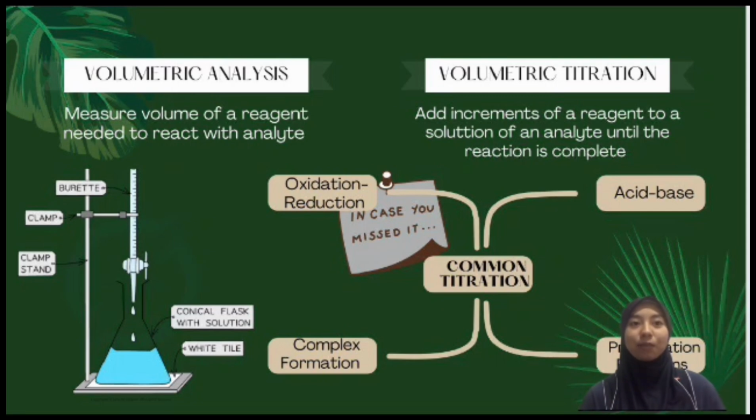Today we're going to talk about volumetric analysis, also known as titration. Volumetric analysis is measuring the volume of reagent needed to react with the analyte. Meanwhile, volumetric titration is adding increments of reagent to a solution of an analyte until the reaction is complete.